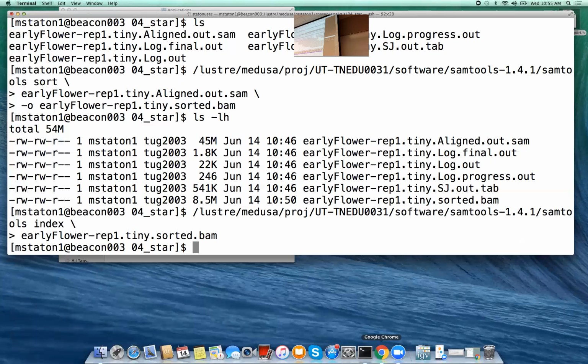This is sort of an underappreciated part of bioinformatics. People forget to look at their data, and you're going to find that the best QC is usually your eye, just looking at it and understanding what it's doing, understanding if it's mapping well, does this make sense? Maybe load up a few different samples, see how they compare to each other. If you have genes that are differentially expressed, you might want to go look in IGV and see if indeed you see a lot of reads from one sample and not a lot of reads from another sample. That would give you a good indication that your statistics are working.